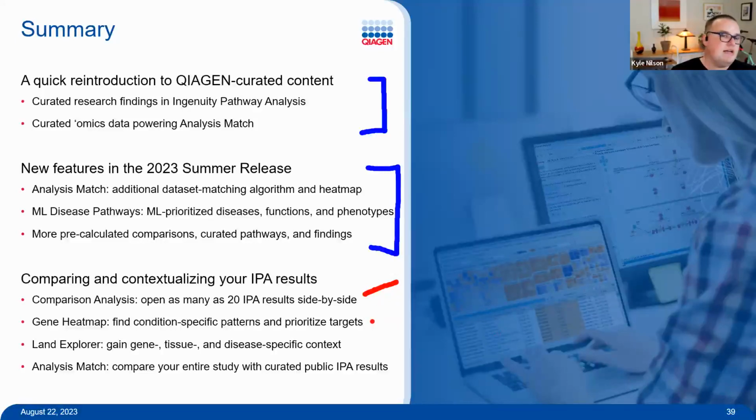Once you click on a pathway, a regulator of interest, something that was predicted up or down, you can load a gene heat map to see how your individual observed changes contribute to that prediction and which ones are in common. So rather than looking at just a piecemeal set of genes that are changing, you can instead focus on the overall broad pattern.